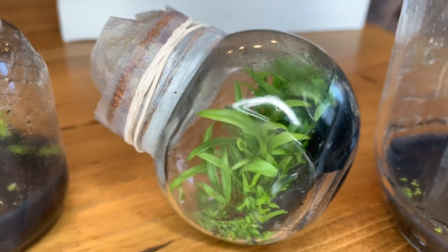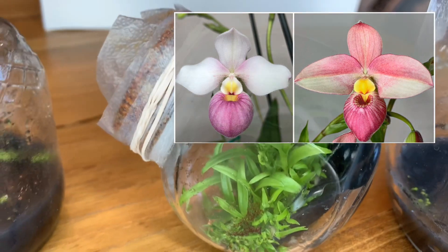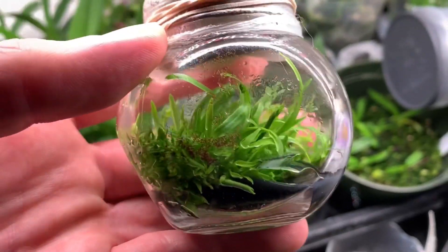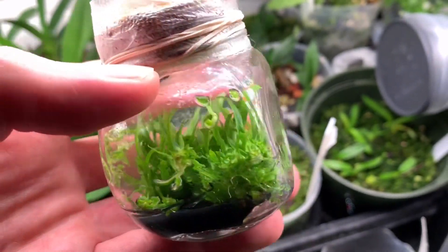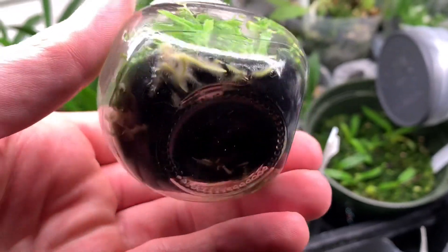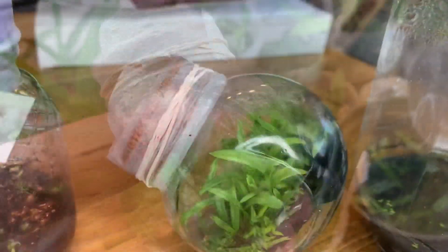The last one is Hane Papao by Pink Panther. These are growing like weeds — I could probably deflask them right now. I was asking some of the guys on the forums and they said to replate for better success, which is killing me because I just want to deflask them. But I will replate them, and if I get a contamination, then I'll deflask them.